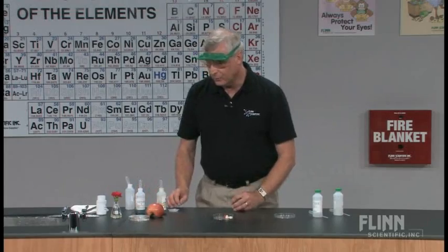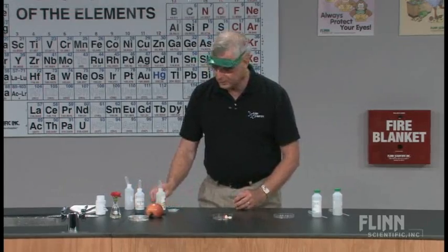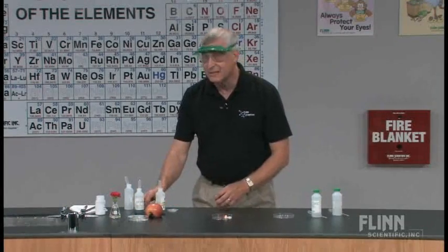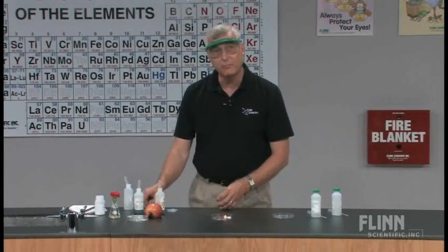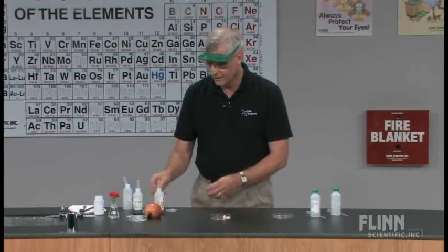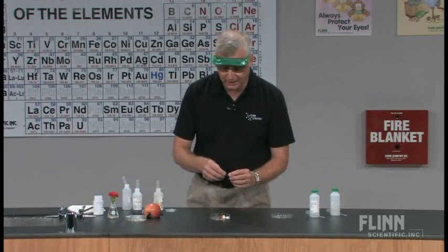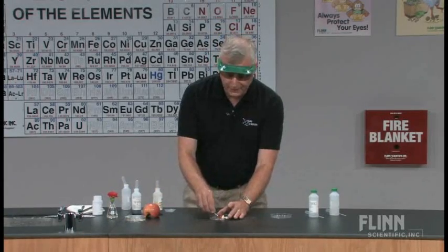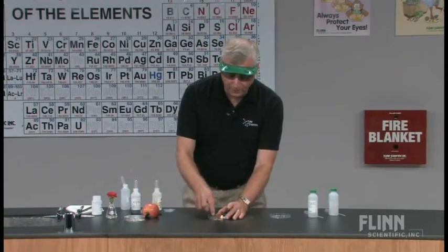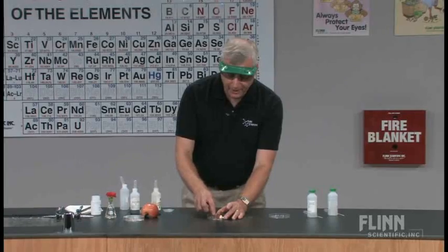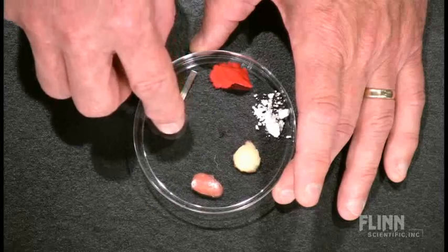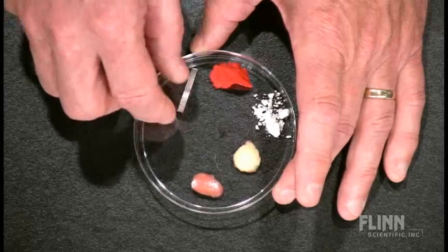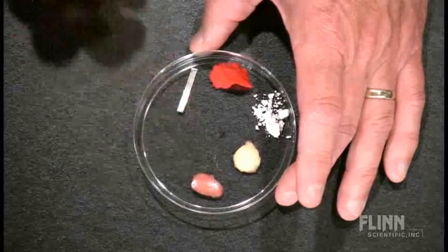Then we're going to take and put a piece of magnesium metal that we've polished so that it's nice and shiny and has a nice reactive surface. And we'll place that in there to represent metals that might be in our environment that we would work with.